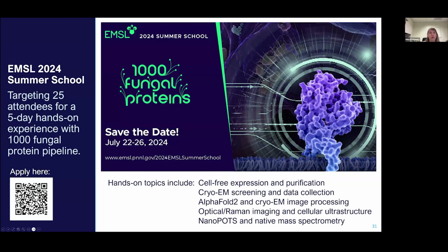And because of all this previous work and now next steps, EMSL decided that the next summer school is going to be devoted to this 1,000 fungal protein projects. This summer school will provide 25 attendees with a 5-day hands-on experience. So every single attendee will be able to select a protein of choice that they want to work with, so they can express, they can do cryo-EM screening, AlphaFold 2 model prediction, and so on.